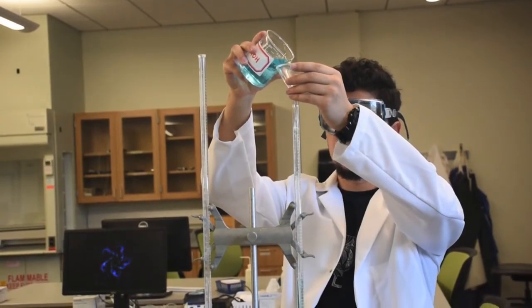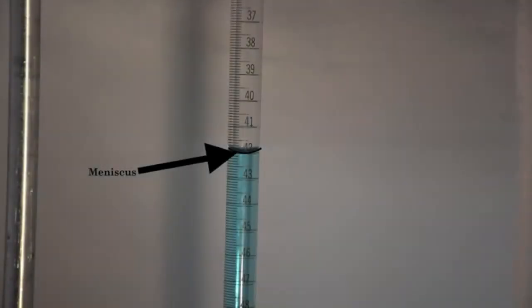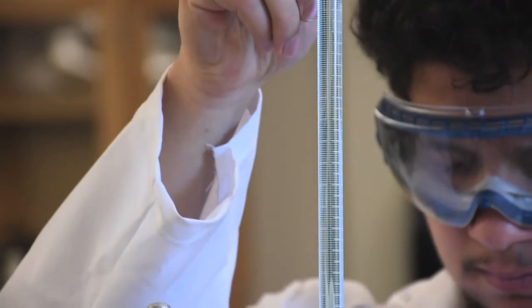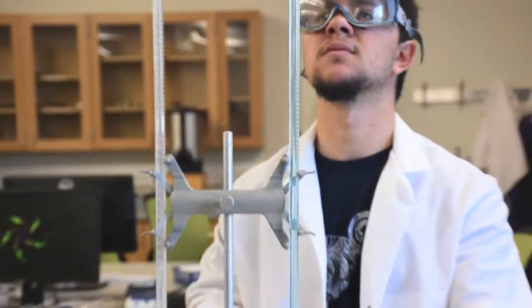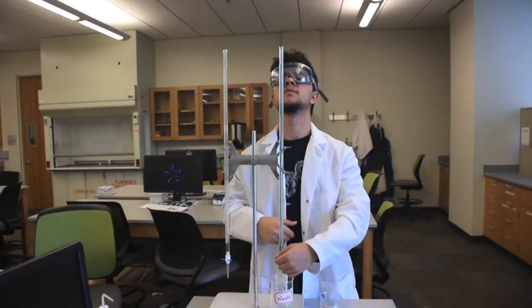When reading the initial volume of the burette, make sure you take the reading at the bottom of the meniscus. For opaque liquids like potassium permanganate, use a flashlight to get a better view of the meniscus. If you have overfilled your burette past the graduations, you may turn your stopcock just a little bit to dispel some liquid.